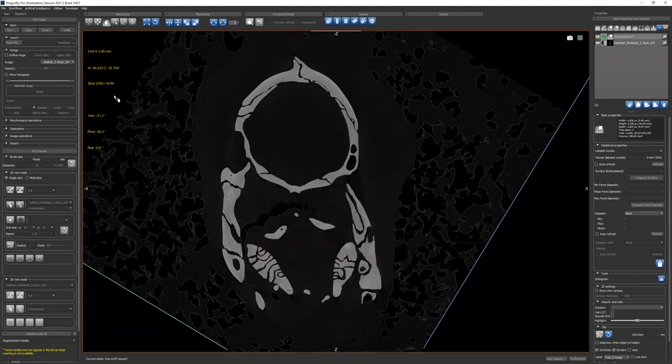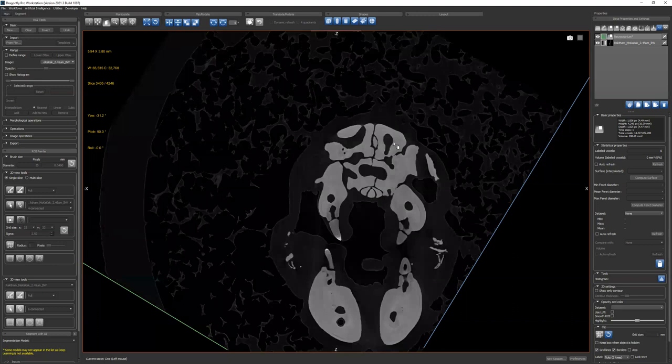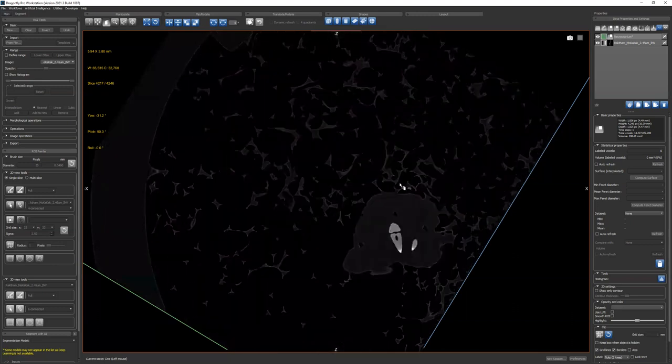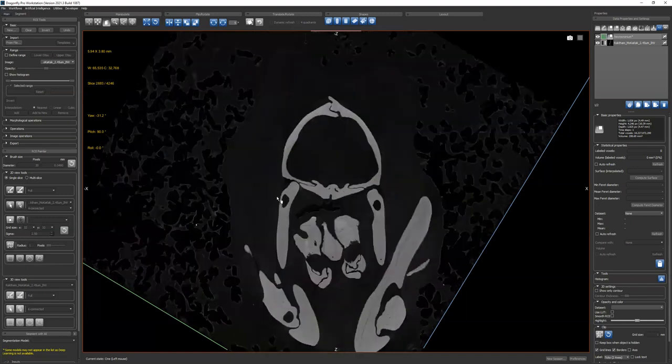So over here, you see these slices. And this is actually different for the 3 dimensions. So that will come in handy later, but just keep that in mind. You have 4,246 slices. So if you found where your neurocranium begins, here, right? Slice, almost at the end. And then you find where it ends.